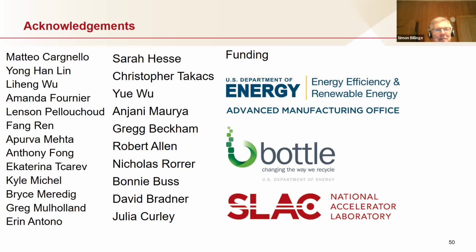Okay, Simon, you had a quick one? Yeah, just on this point of Uta's, I think developing the next generation of beamline scientists who know all the hardware is a different issue, but training the users, because in principle we're making the experiments much less costly. So you can be sitting at home and actually running the instrument. It's actually somehow easier to train, and you can train an AI to make a tutorial which has the slits set badly, and you don't tell the person. So I agree with the digital twin, but that's a heavy lift. We tried to do that for the XPD instruments, and my group turned into 100% just working on this digital twin, which wasn't going to result in a Nature paper or indeed any paper.